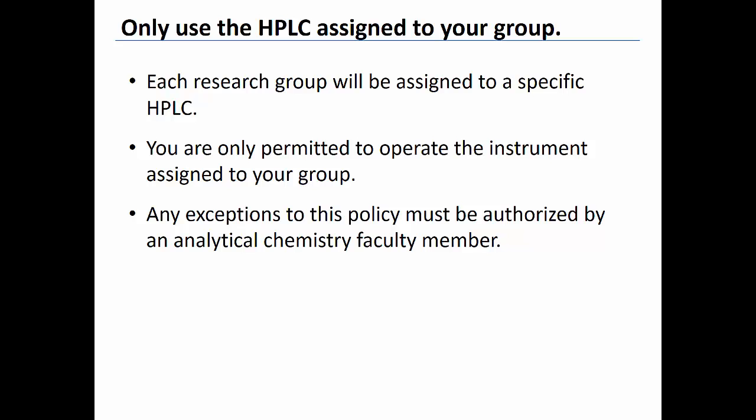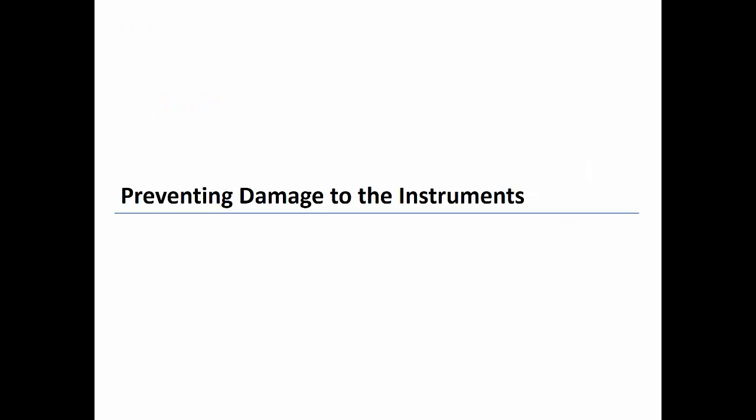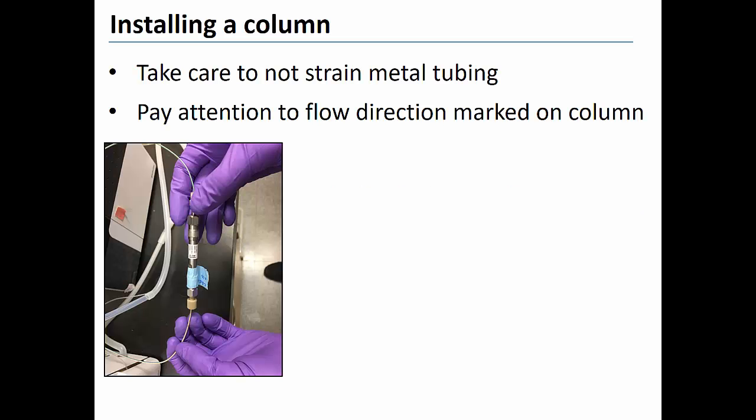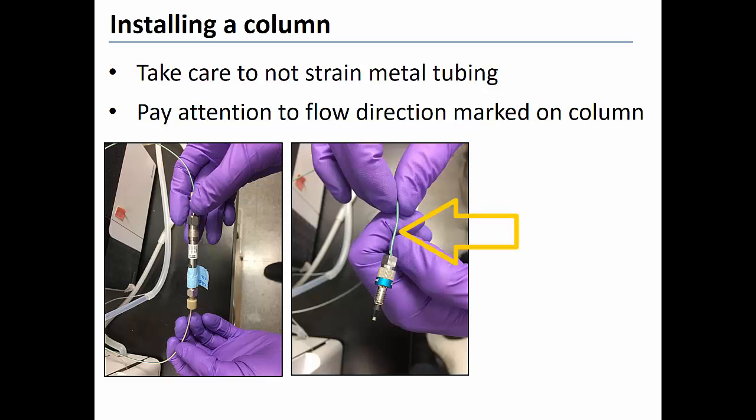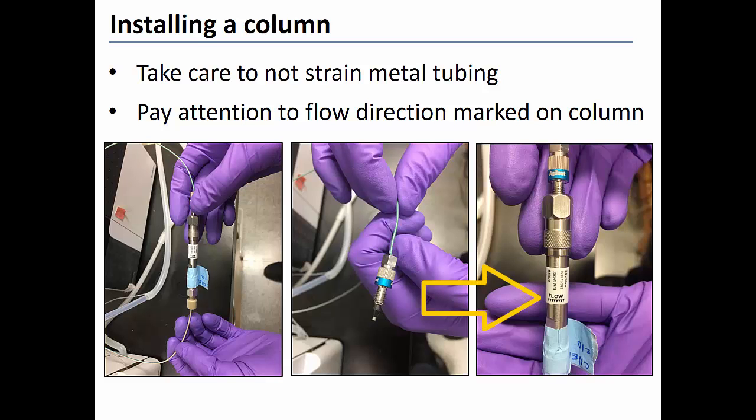Next, let's consider some important steps you can take to minimize the risk of damaging the HPLC assigned to your group. When you install an HPLC column, be careful not to exert any unnecessary strain on the metal tubing leading to the inlet side of the column. This metal tubing can snap if kinked or strained. All HPLC columns are marked with the correct mobile phase flow direction. Be sure to connect the column accordingly.